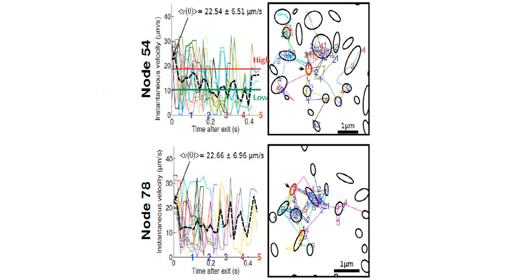And we marked the different time steps using the numeration 1, 2, 3, and so forth. So we could see after one step, two steps, how far away the different trajectories are from one single node. And as can be seen here, the trajectories after some time are found in neighboring nodes.